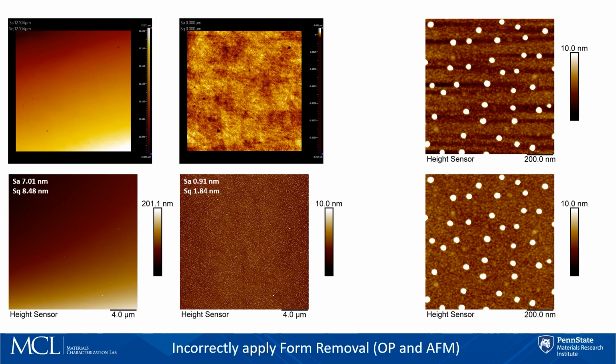So essentially, you want to make sure that when you are post-processing your data, you're not introducing effects which will change your reported value. So what was better done instead of a first order line fit was actually a first order line fit with a threshold value for excluding the particles and flattening just with respect to the surface.